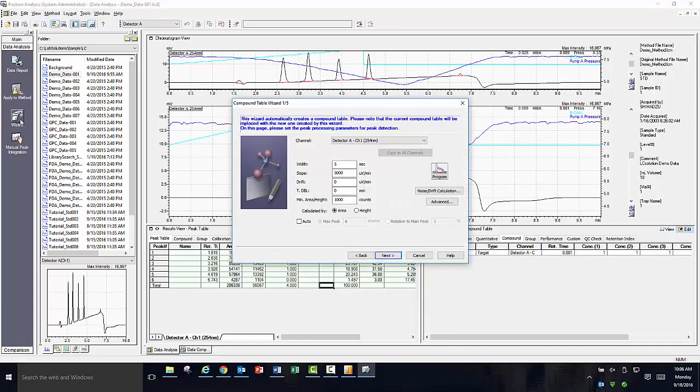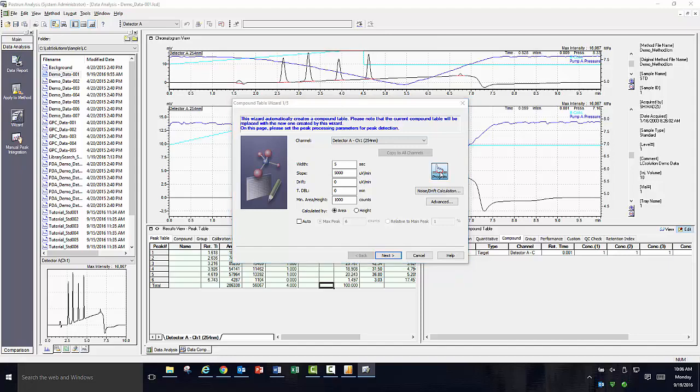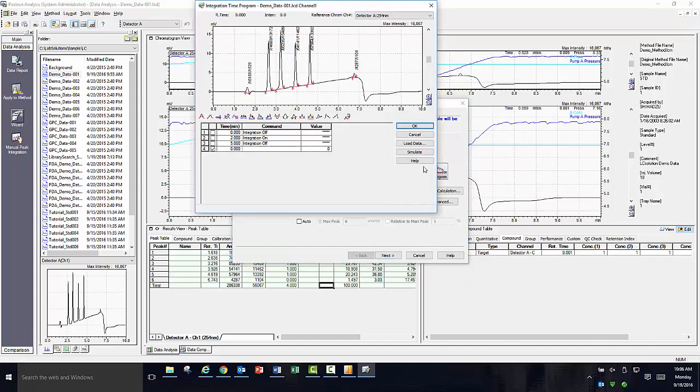The window that pops up first shows some initial screening criteria for your chromatogram. This includes minimum peak width, slope, drift, and minimum area or height. As we have done before, you can also click on the program icon and manually apply integration parameters and preview the results before applying to the data file.